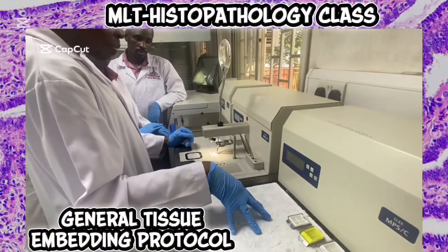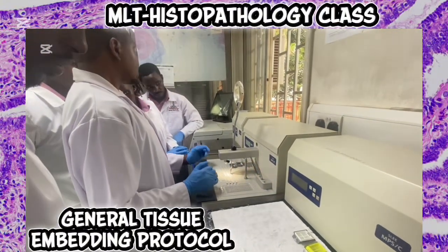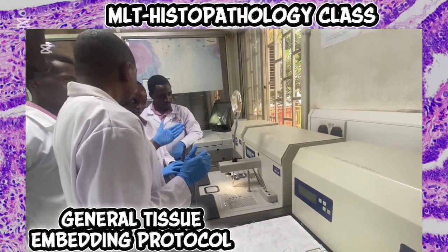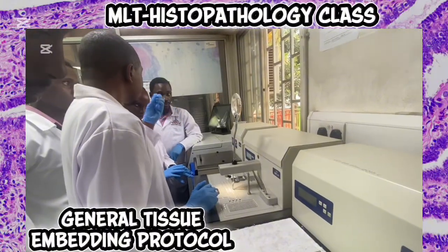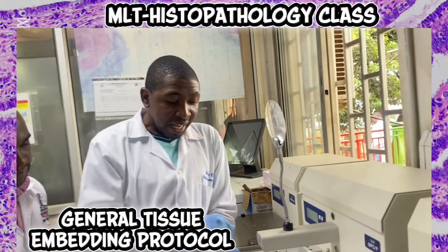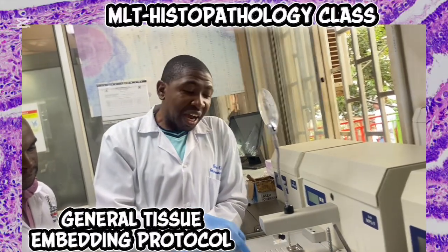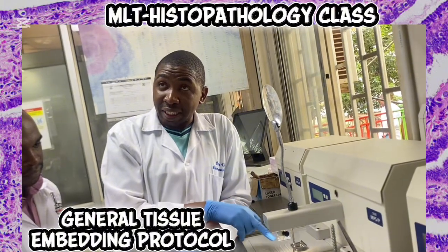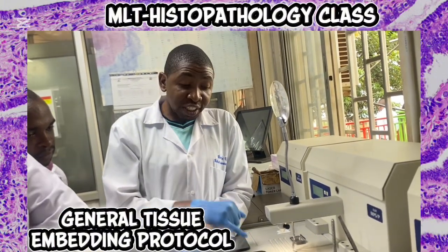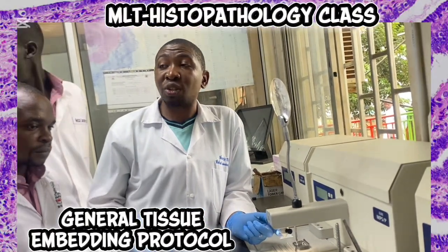So here there is rapid solidification. When you look at the temperatures, it is -4. In most cases, it is between -5 to -15. Those temperatures will give us rapid solidification of the wax. However, the timing between the small cold plate and raising to completely fill the mold should be very short. Okay? Because if you delay and this one solidifies, then you add on paraffin wax, it also solidifies.